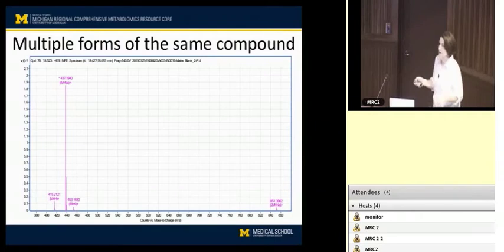There's a number of reasons to do that. For statistical analysis, the more of this redundancy you get rid of, the more likely you are to be able to bring your false positive discovery rate down to something that's rational, and you won't have to do a lot of cutting off.